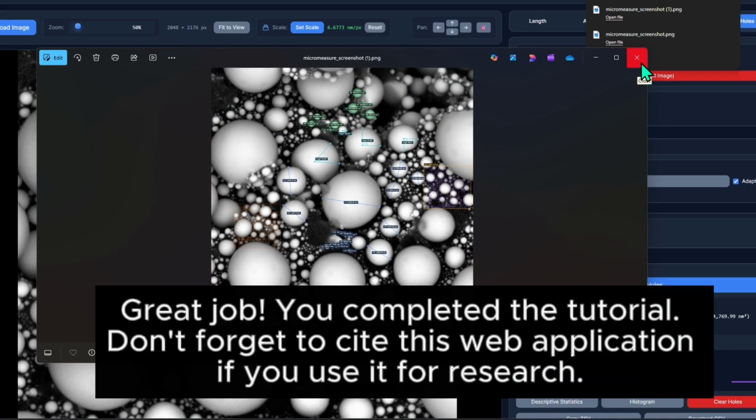Great job! You completed the tutorial. Don't forget to cite this web application if you use it for research.